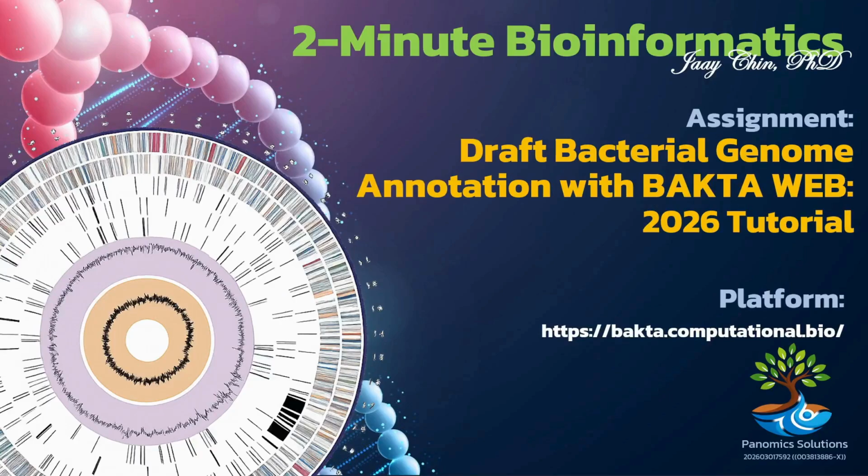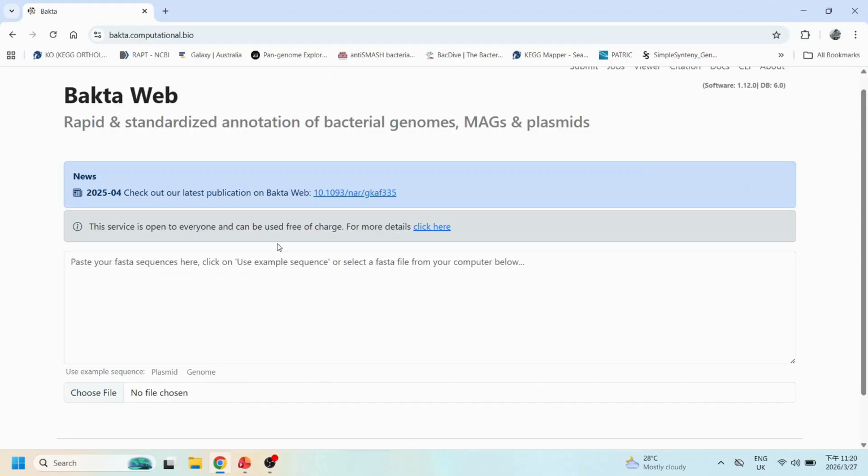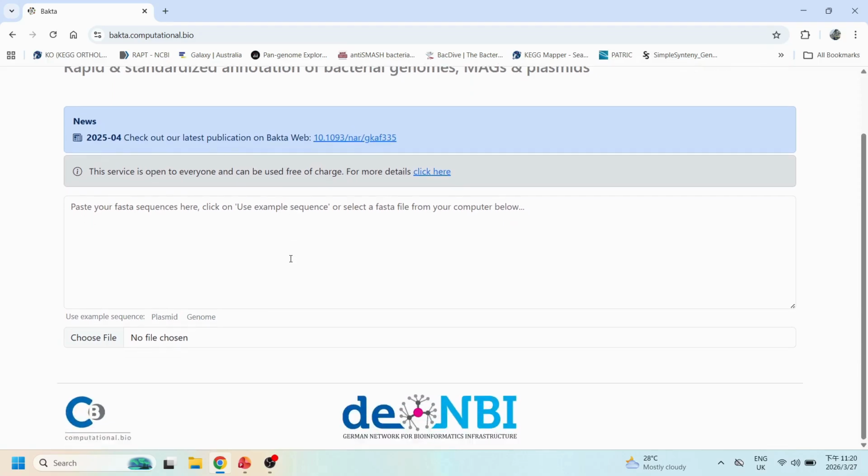In this 2-minute quick bioinformatics tutorial, we will learn how to perform draft bacterial genome annotation using BAKTA Web. This 2026 tutorial will guide you through the essential steps to quickly and efficiently annotate your bacterial genome data using an easy-to-use online platform. Let's get started.